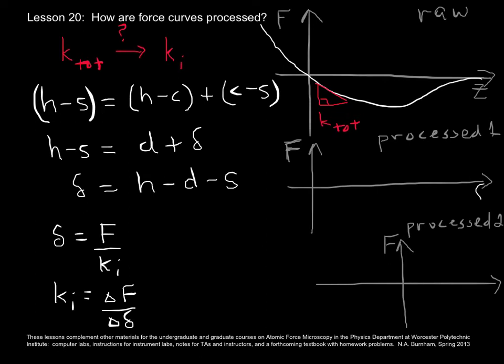So these two process curves I'm about to sketch in 2 steps have delta on the x-axis, the separation or penetration depth.